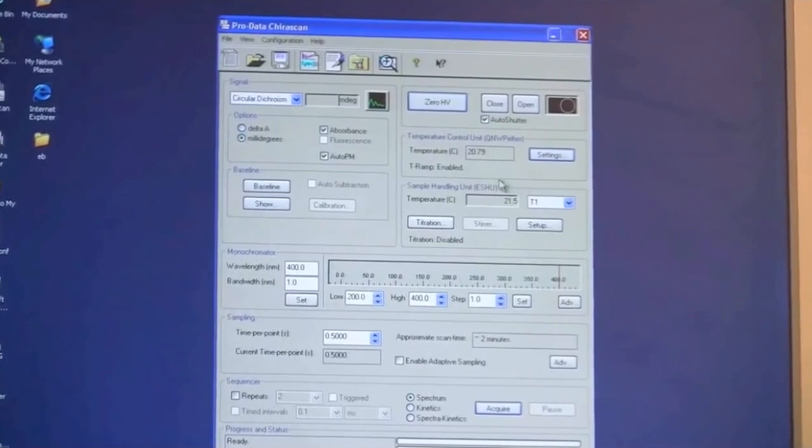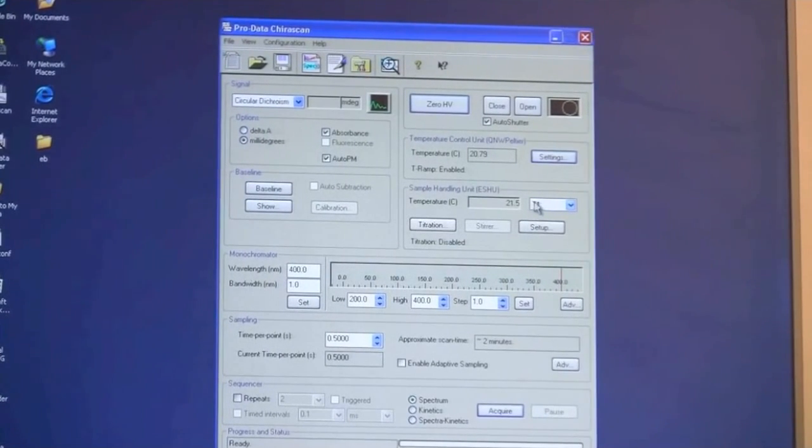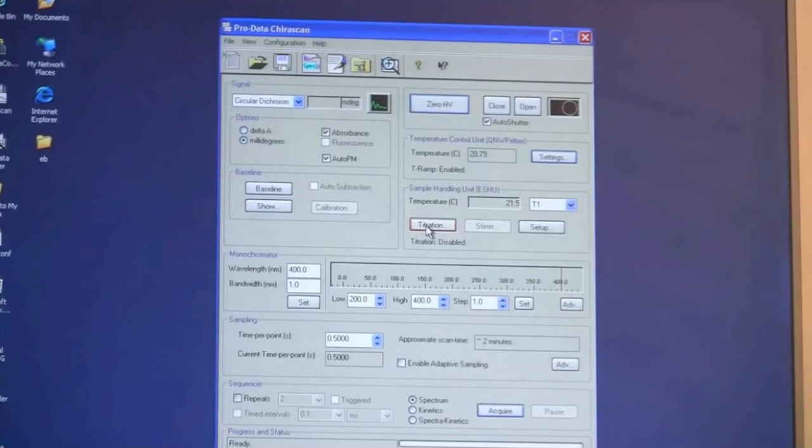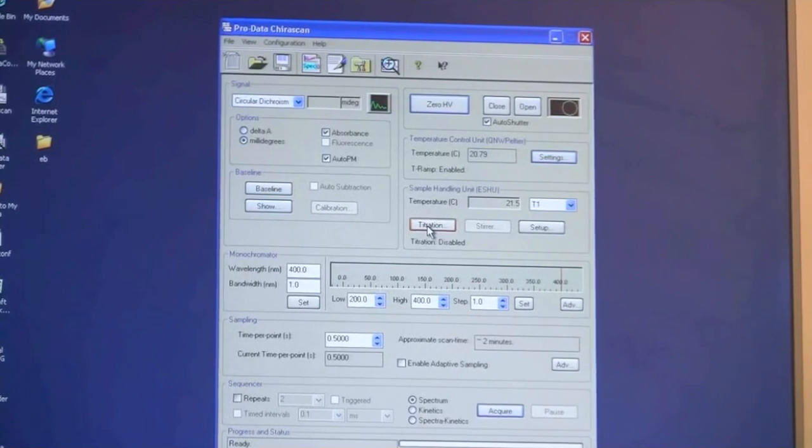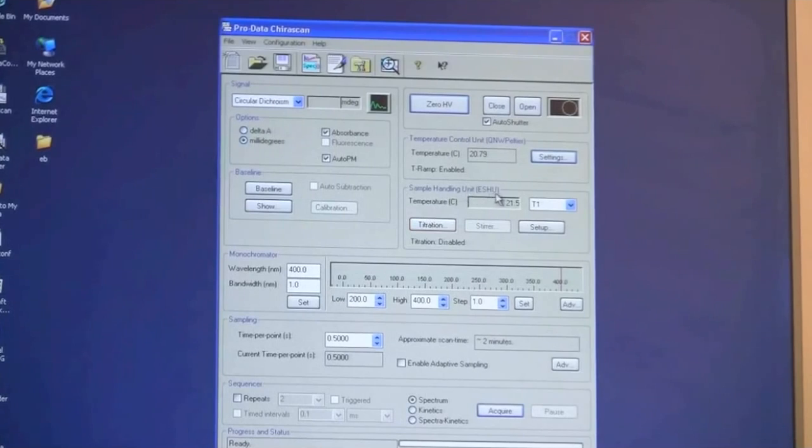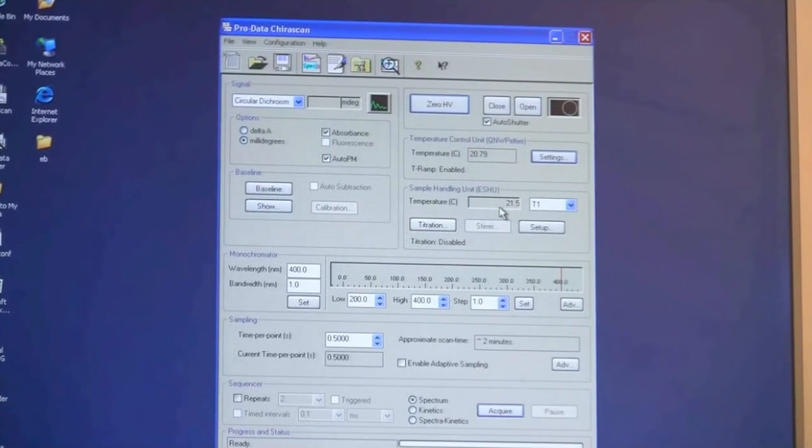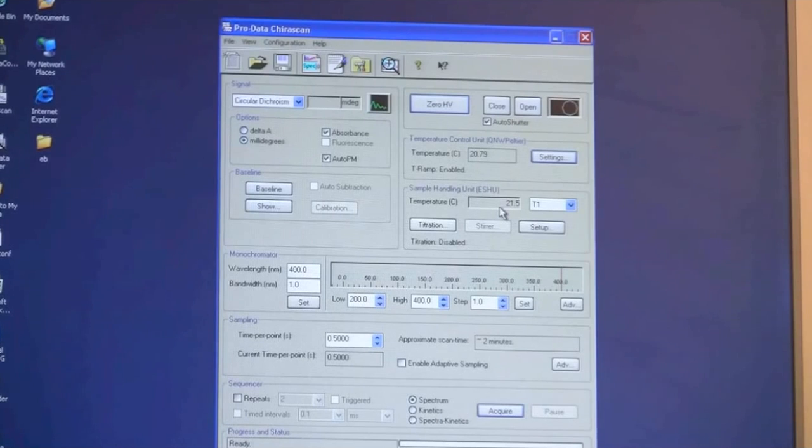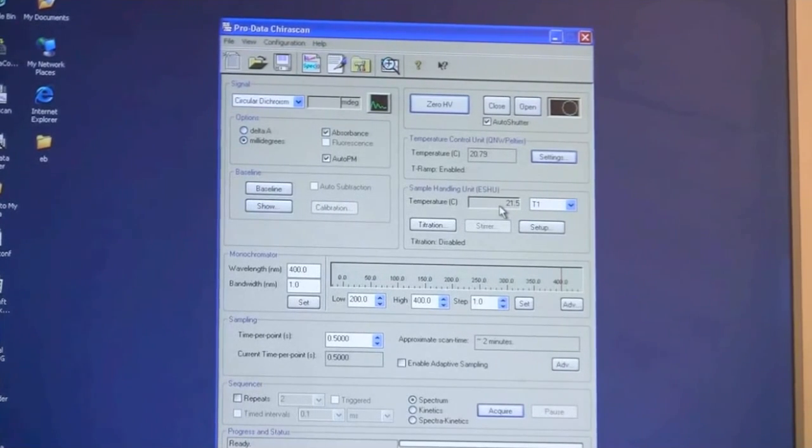Down here there is the sample handling units area. You have an option of using a titrator which is currently not attached to the instrument but it could be if you are interested. It shows a temperature display here which is a small temperature probe that you have the option of putting into your sample so you always know what the temperature of your sample is.